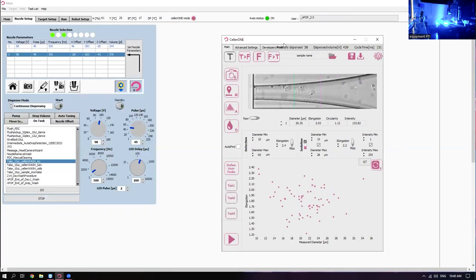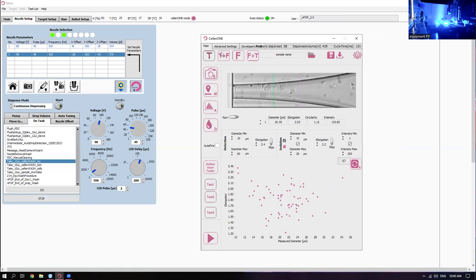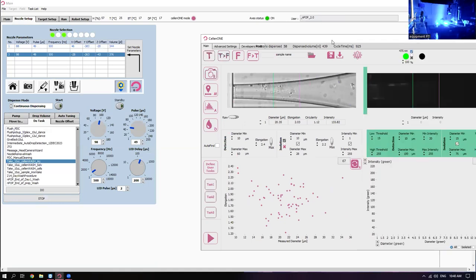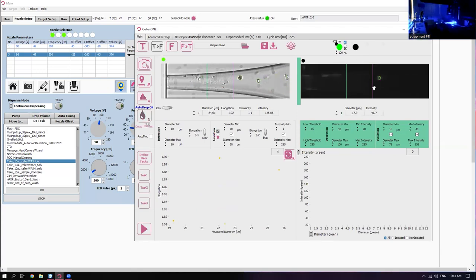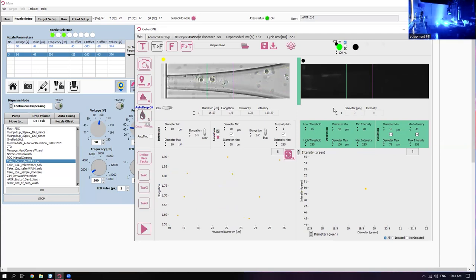I don't believe these are stained. If they were stained, then we could use this fluorescence. We would first check that there's a single cell, and then we would check that it was negative for this fluorescence marker, the dead cell stain. But I don't believe that we have stained these cells, and so we're not going to end up seeing much of anything on this fluorescence. Oh, maybe we did stain them.